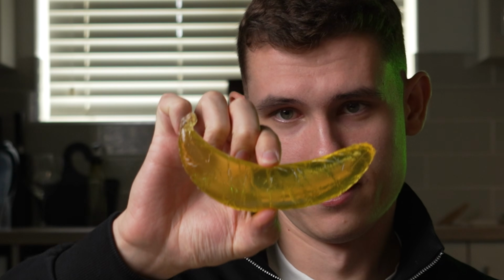So, it's finally time to test this banana. Obviously, the taste of a real banana is a super complex thing that comes from different compounds, but I wonder if isoamyl acetate can give at least some vibe of banana.